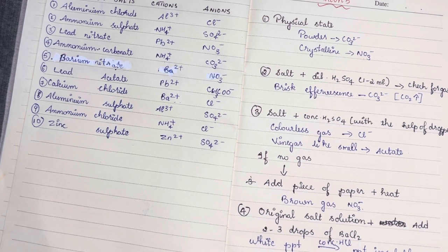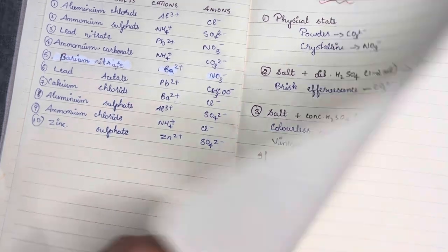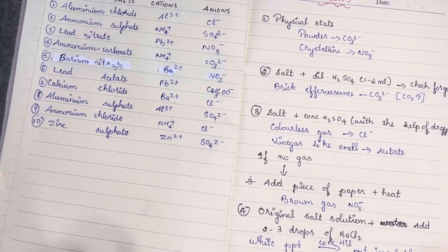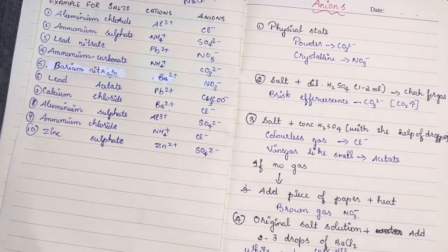That indicates the presence of SO4 2 minus, that is, the sulfate ion. So this is how you detect the anions present in the given salt analysis.